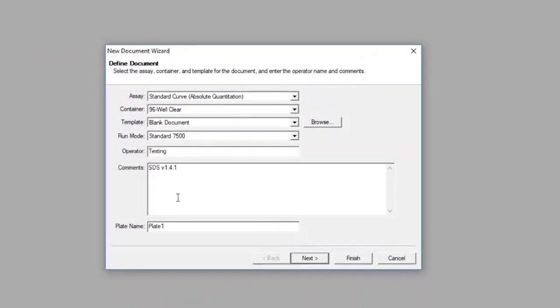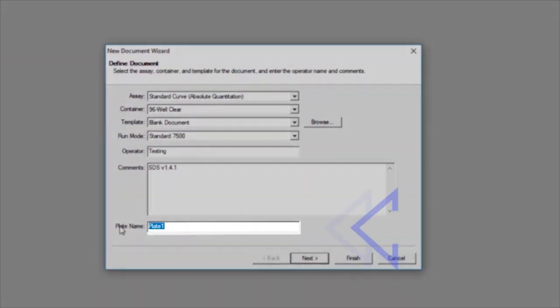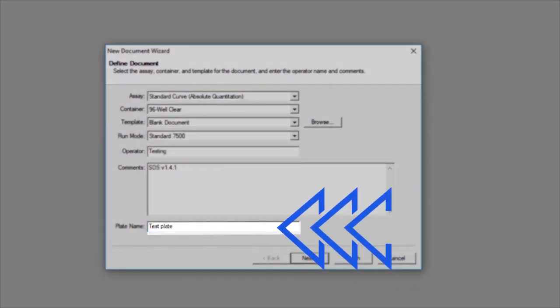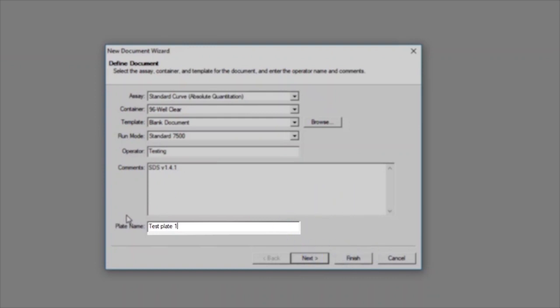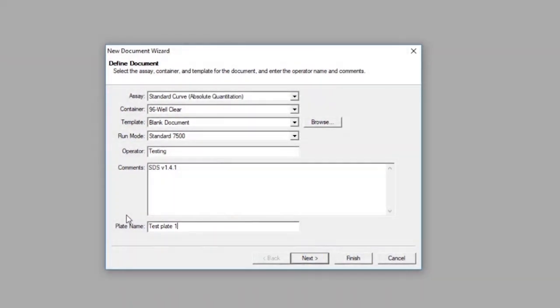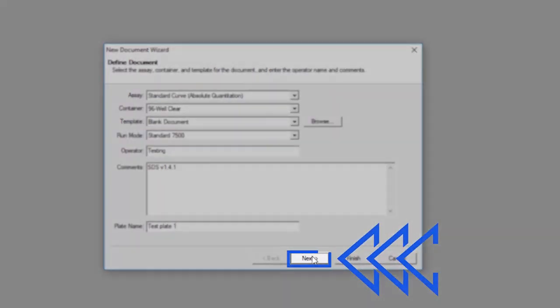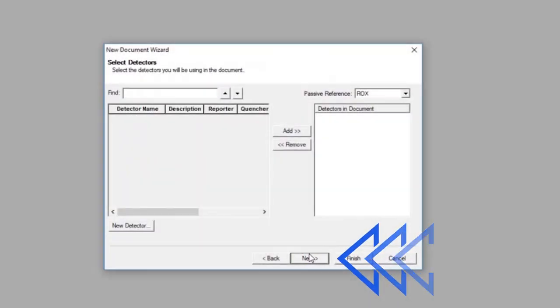Finally, the Plate name is the name in which the files will be saved. The plate can be named any way you choose. Once these settings have been selected, click Next at the bottom of the New Document Wizard screen.